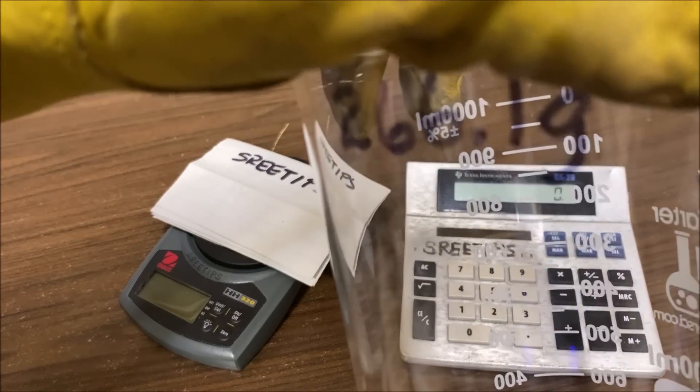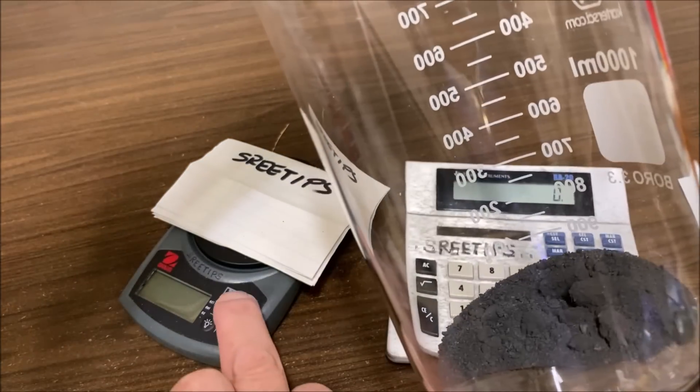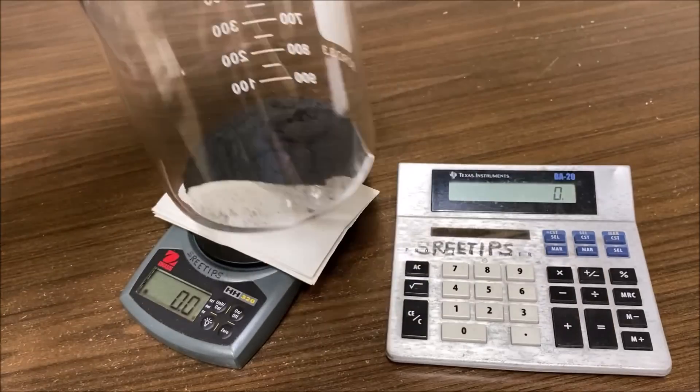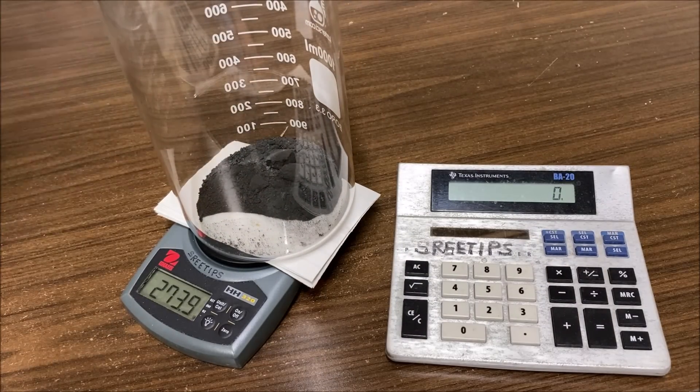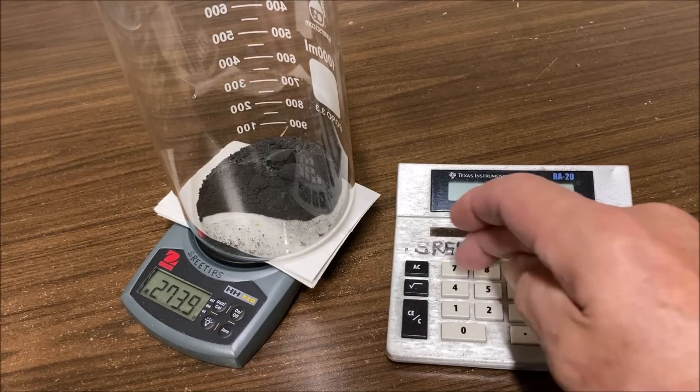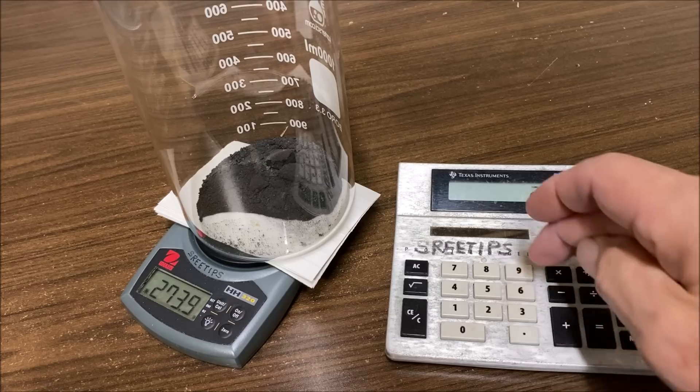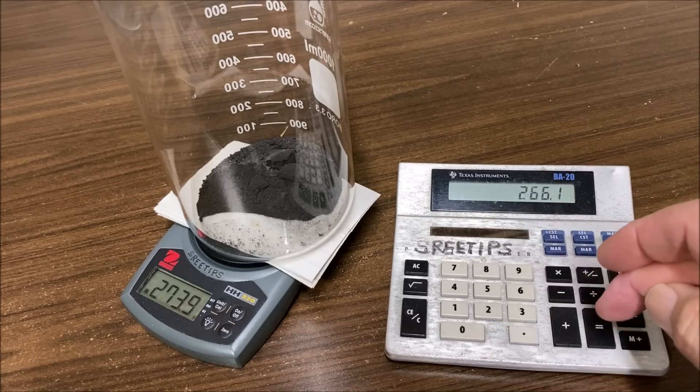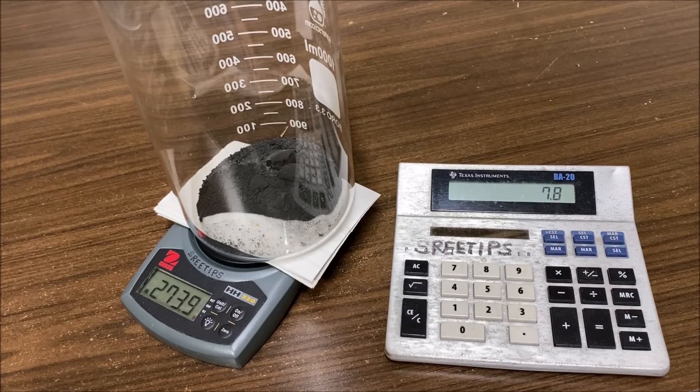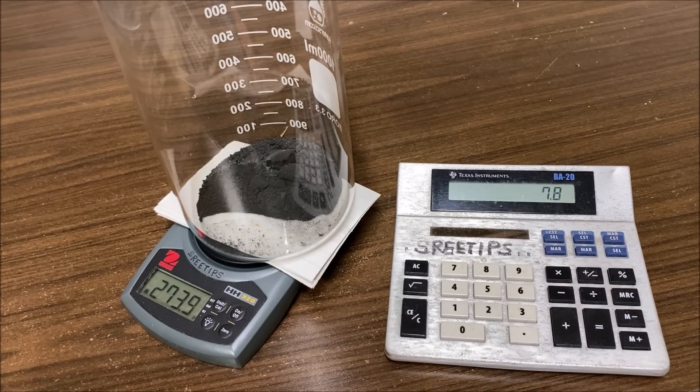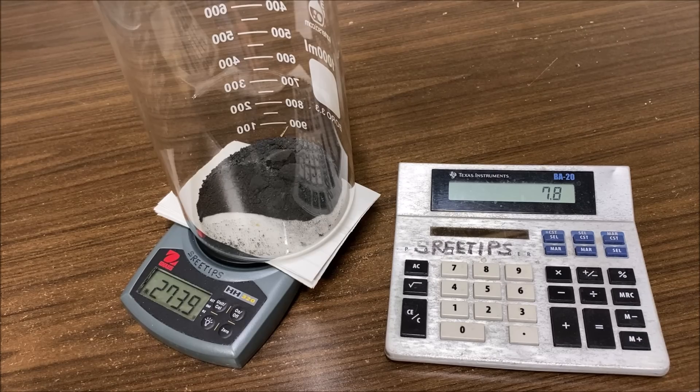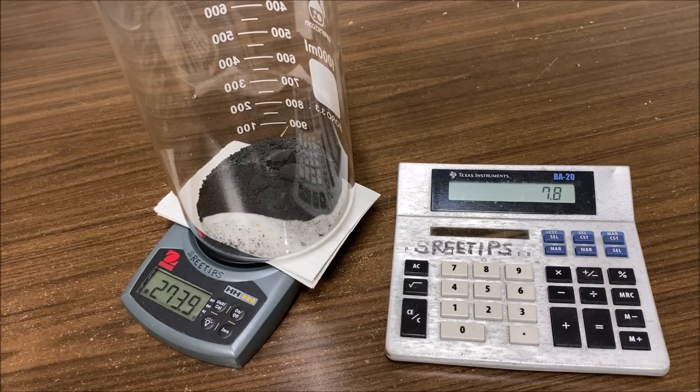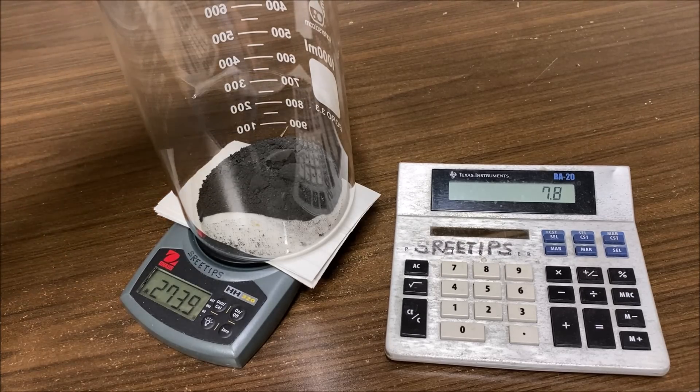I've got the weight of the beaker 266.1 and this is critical for the next part of the process. So we've got 273.9 minus 266.1 equals. So we've only got about 7.8 grams of mixed black PGMs. I was hoping for about 10 is what we really need, but we'll go ahead and go with this.